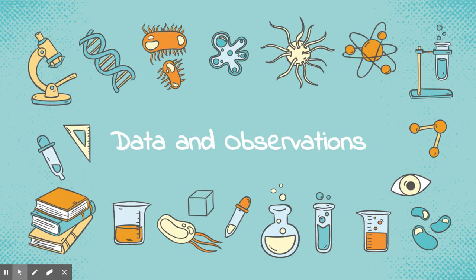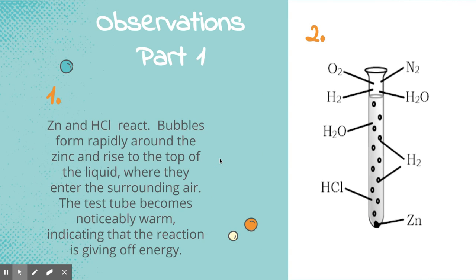So in part 1 observation, whenever you went to put the zinc and the acid together, hopefully you realized that you've done this reaction before.